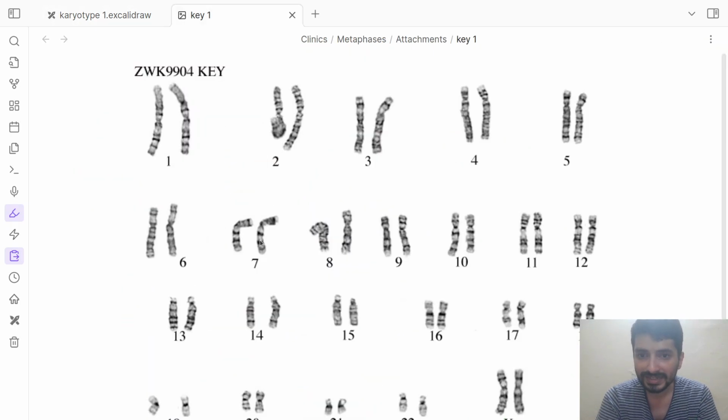Chromosome 7, like I said, have some of the darkest bands on a metaphase spread, and they are thus easy to identify. Again, two dark bands on the long arm. So like we had identified this chromosome 8 based on elimination, you can see these dark bands here and probably one dark band here, but obviously unless this chromosome is straight, we would not be able to really comment about it.